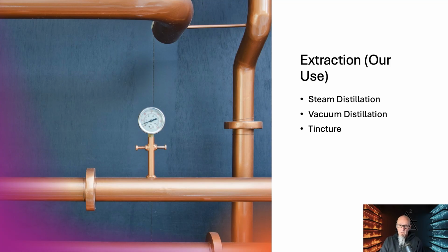So we're going to actually use this steam in this process to effectively split into two separate parts. Well, technically three because we're going to have our caput mortem still in the still, but effectively it's going to break it apart into two parts over into the collection flask.